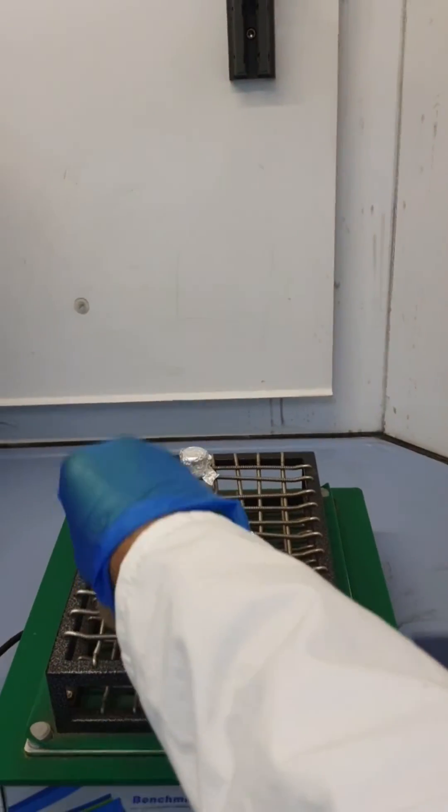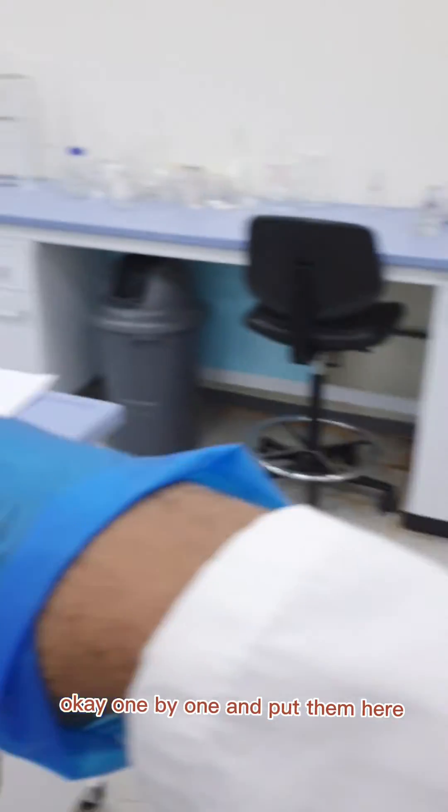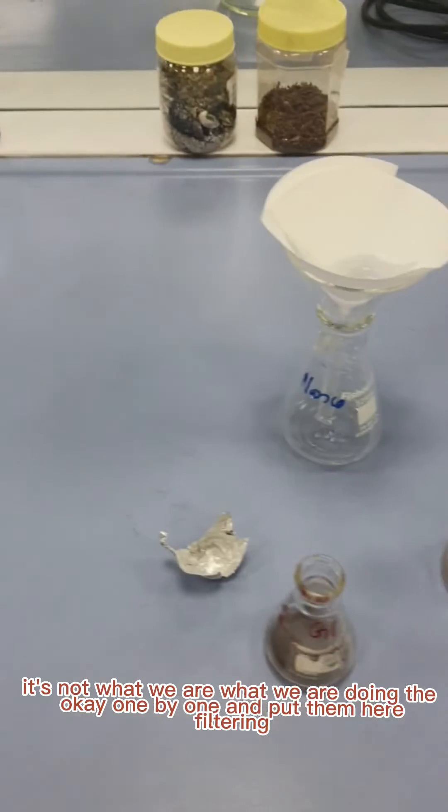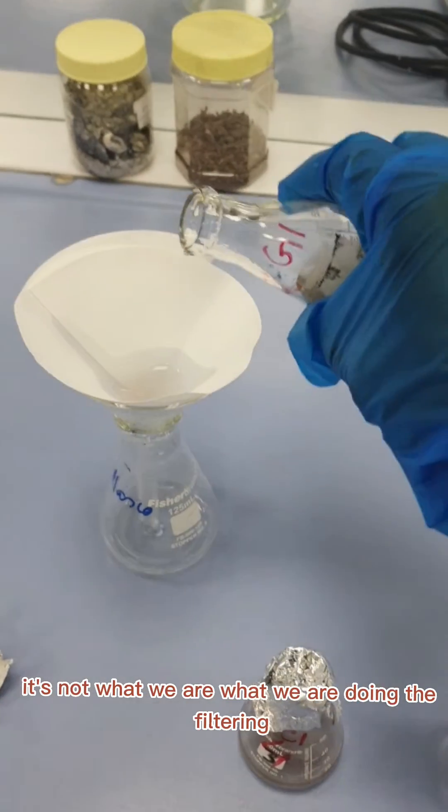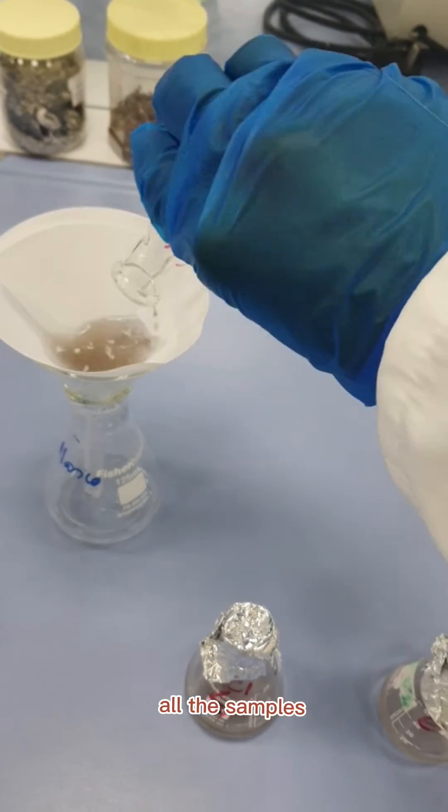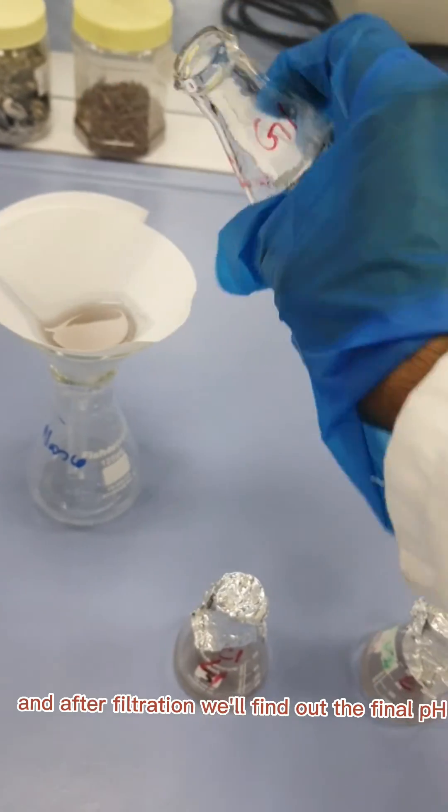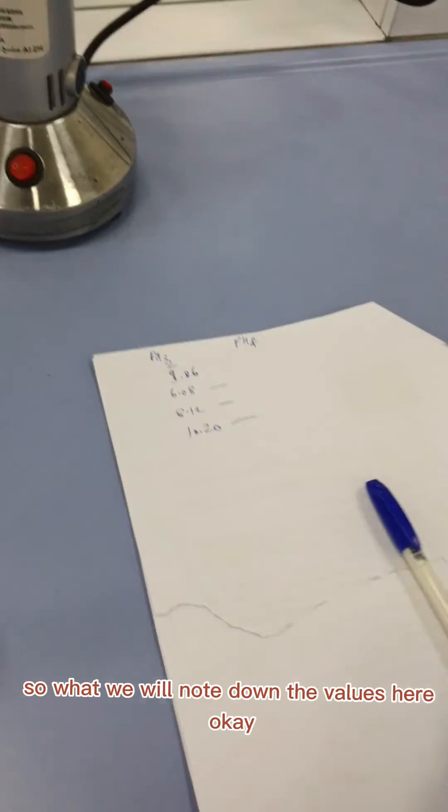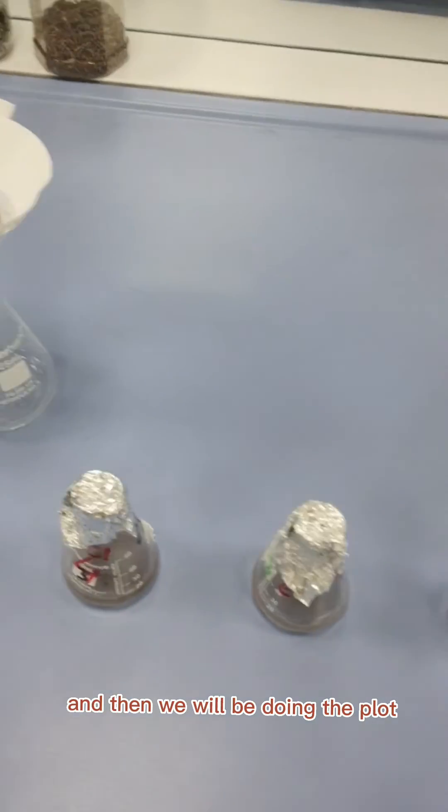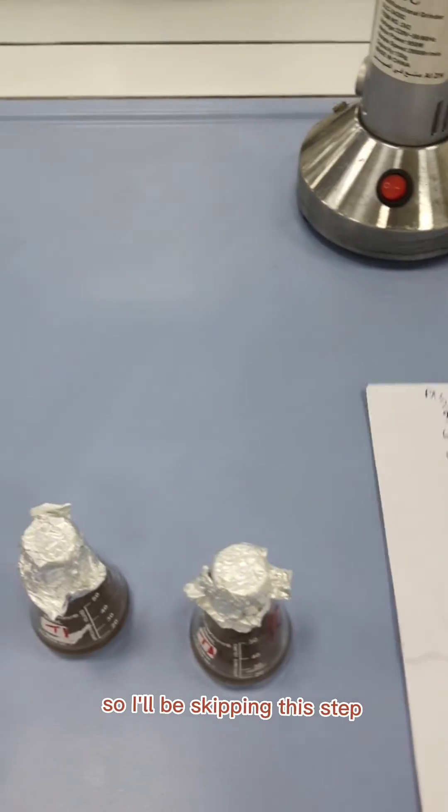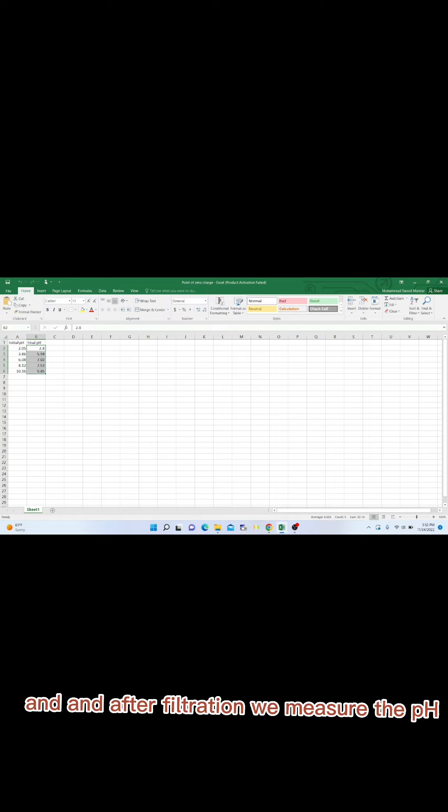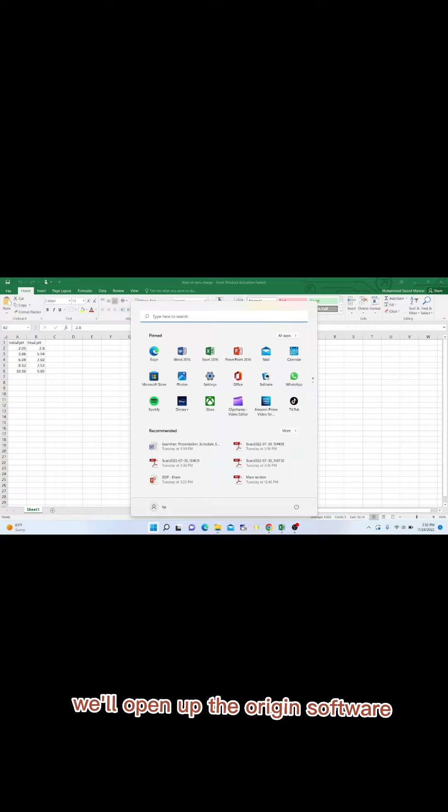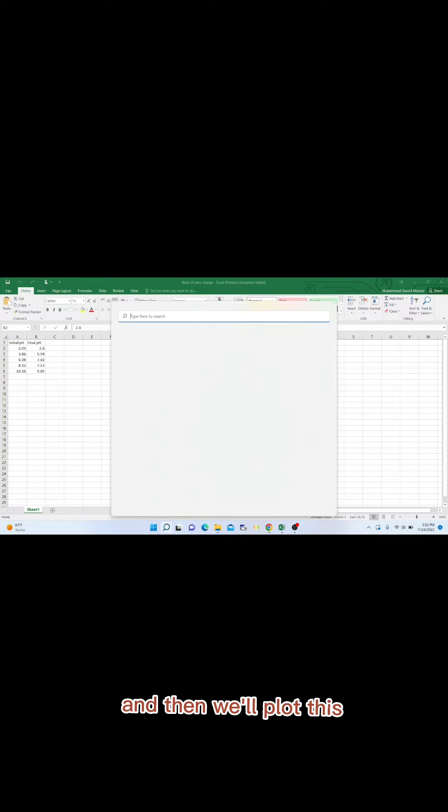After 24 hours is done, what I will do is take out these vials one by one. Now what we are doing is filtering all the samples. After filtration we will find out the final pH. We will note down the values here and then we will be doing the plotting.